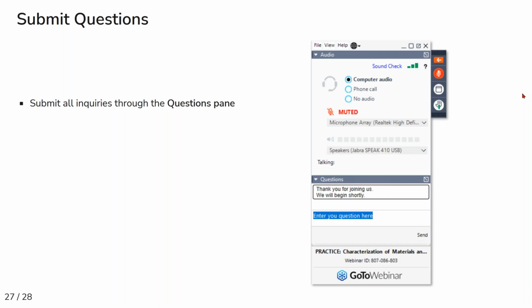There is some interest in knowing what kind of grids you use for your tomography studies. Was it a gold grid or was it copper? Turns out, I tried all of them, and the data is probably a mixture, but the one that in the end consistently gave the best data were C-flat grids. And that is a problem because probably 90% of C-flat grids are broken after that procedure. So in the end, what worked best was tons and tons of C-flat grids and screening them for the few ones that are not broken. That gave the best data.